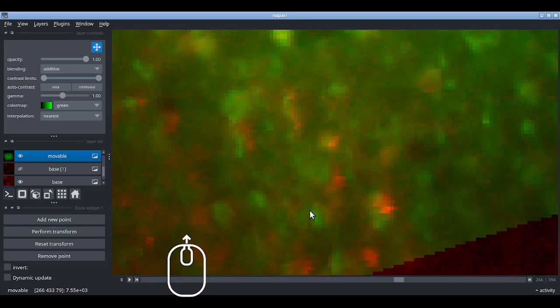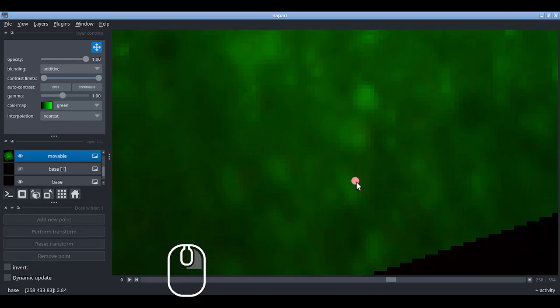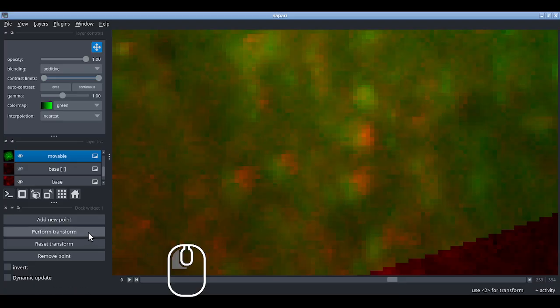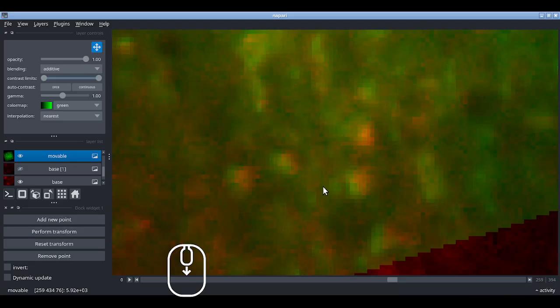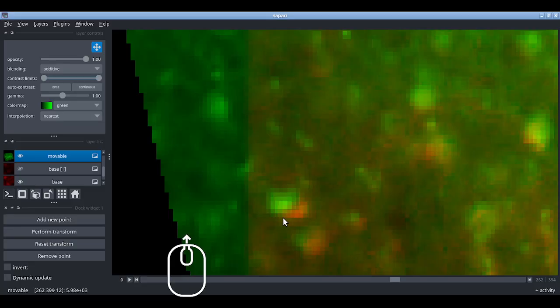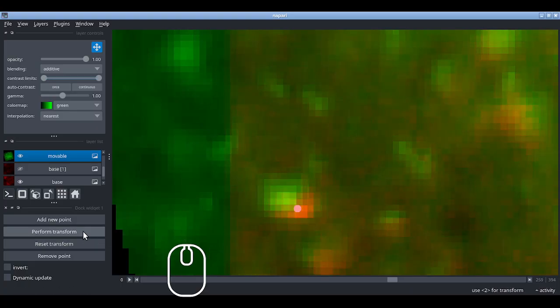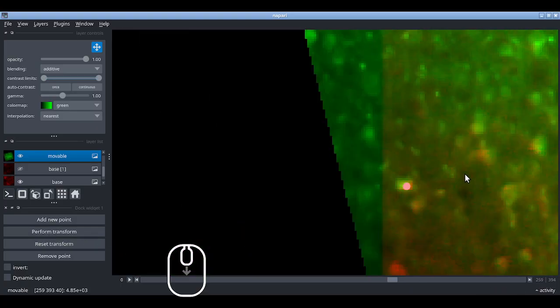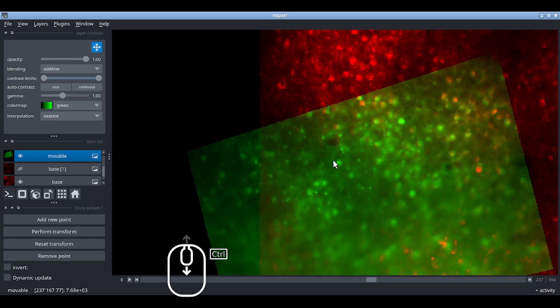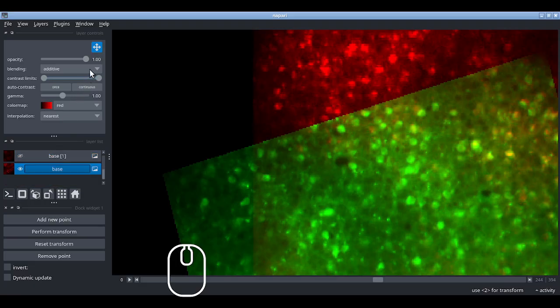Okay, now we can even work our way over here. Ooh, fancy. Okay. This and that, I think, are good. Let's see how that looks. That looks pretty good. Oh, maybe this pair is good. Nice, beautiful. Okay. That looks pretty good. Let's turn up the background here.